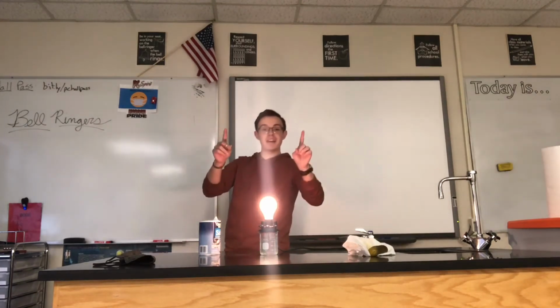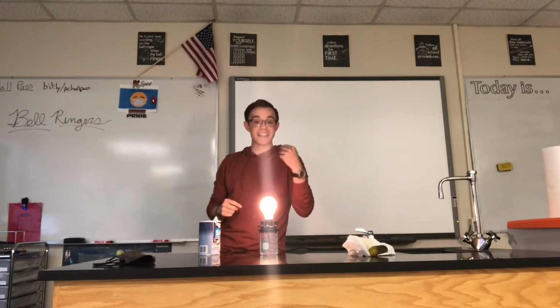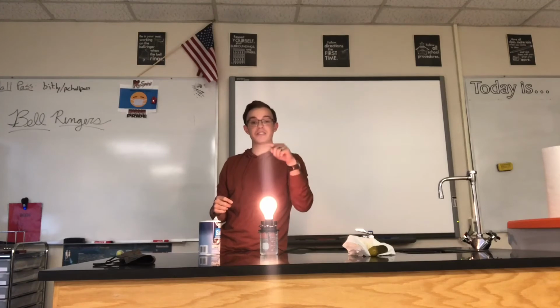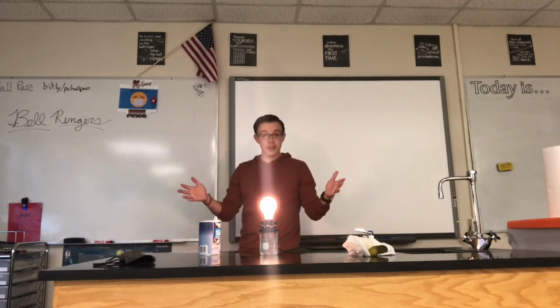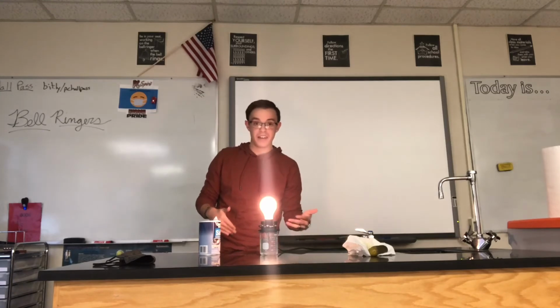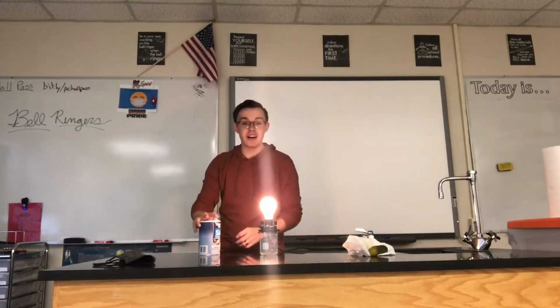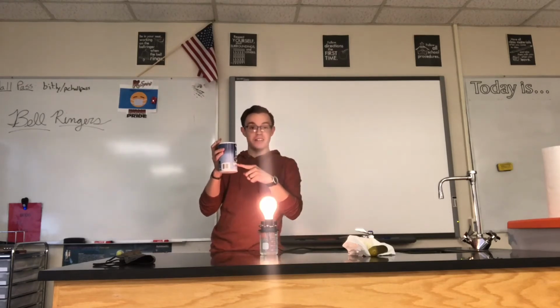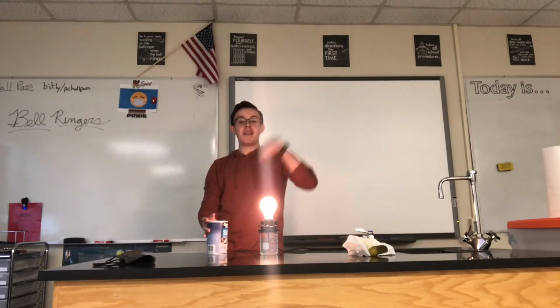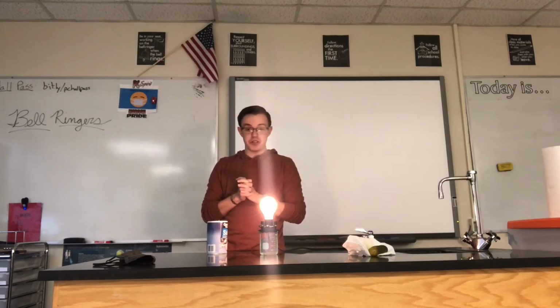That is a big, very important characteristic of ionic compounds, is that they conduct electricity when dissolved in water. The water doesn't conduct electricity. It's what's called a covalent compound. It's just hydrogen and oxygen, two nonmetals. But when you have an ionic compound, that's what conducts electricity within the water. Okay, so big important characteristic of ionic compounds there.